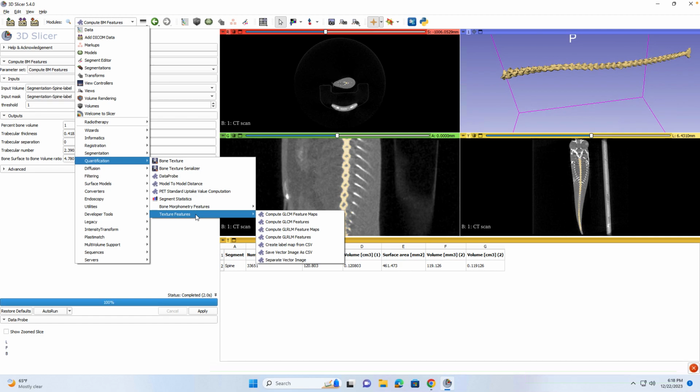So it's gray level run. It means something. Like I said, I wrote it down. I don't know why it's not showing up again. But these runs are what it is. So every time it makes a run, it's scanning it. So it's scanning it in those different directions.